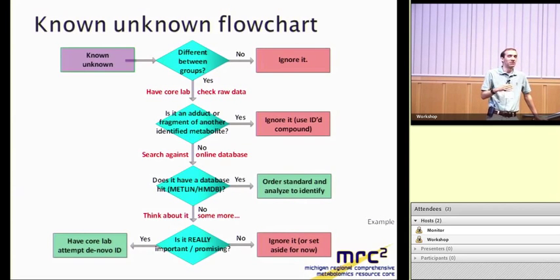So it's normally sufficient to just mark it as a fragment of X and leave it at that, rather than trying to sum some sort of signal or average signals between the different compounds. So in general, we'll just leave it there and annotate it as an adduct of X, and that's where you would leave it.